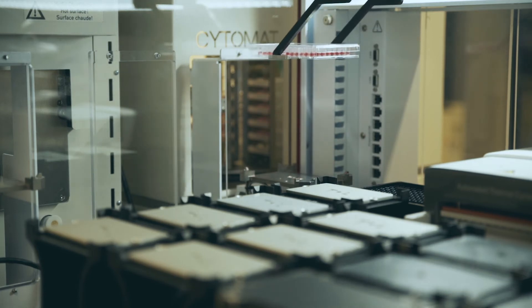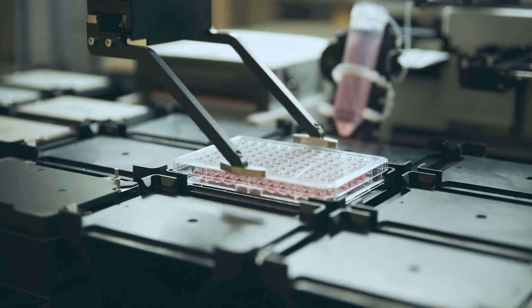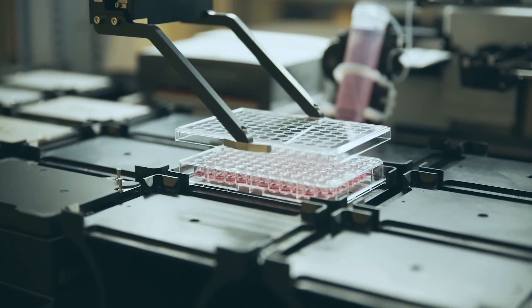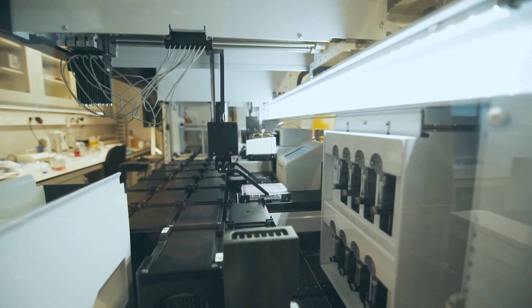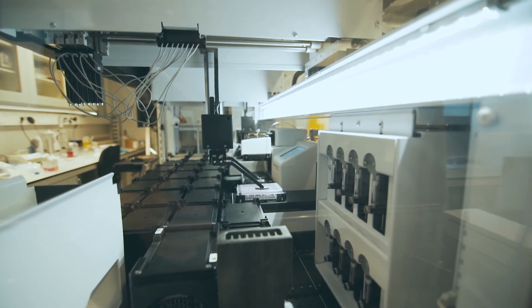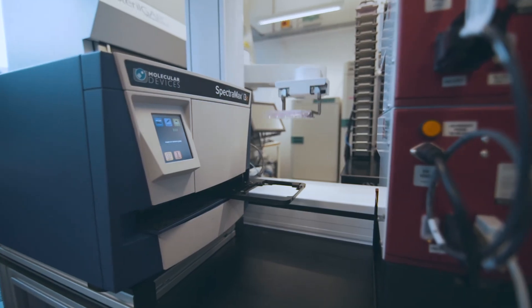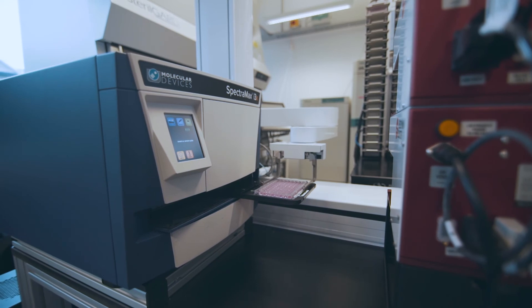Biomech grippers can move plates between different on-deck positions while the robotic transporters move the plates between integrated devices. The data acquisition and reporting tool captures sample, plate and process data across multiple instruments.